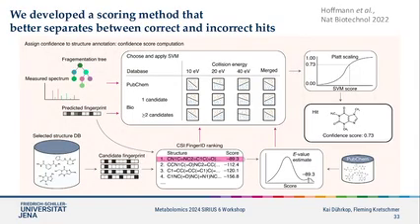So we developed another tool called COSMIC, which not only considers the score, but also the database you search in and a lot of other information like data quality and so on. And in the end, it gives you a score between 0 and 1, which tells you how likely it is that this annotation is correct or not.